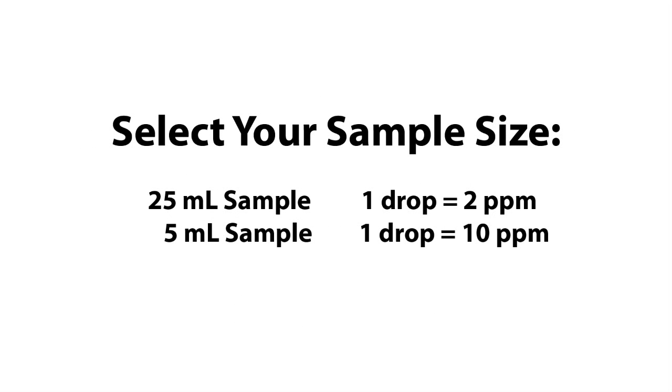The first step is to select the proper sample size based on your desired drop equivalency. In this example, we are going to use a 25 mL sample, therefore 1 drop equals 2 parts per million chloride.